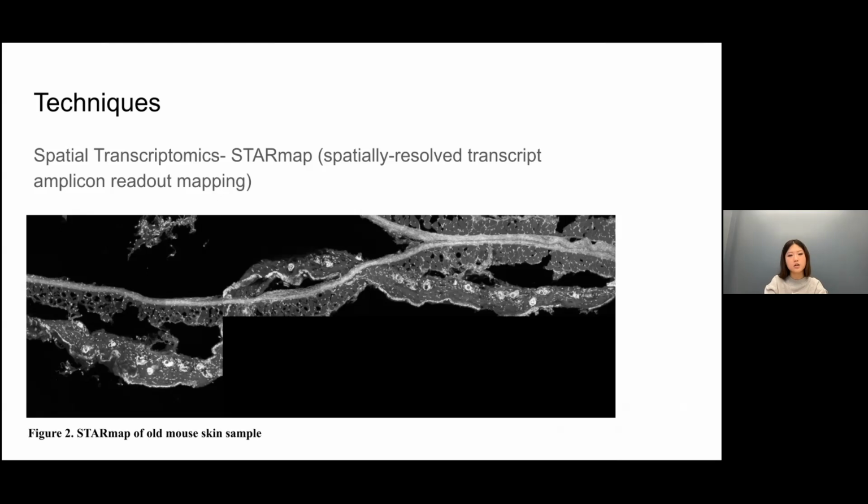For our project, we did 6 rounds of imaging and 5 channels. To break it down, we ran multiple rounds of imaging, and at each round, it helped us reveal a different part of the gene code.